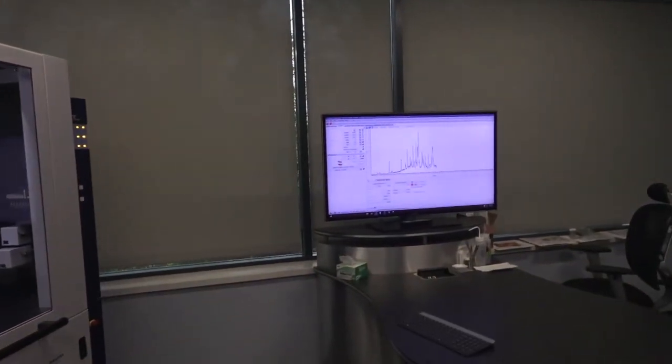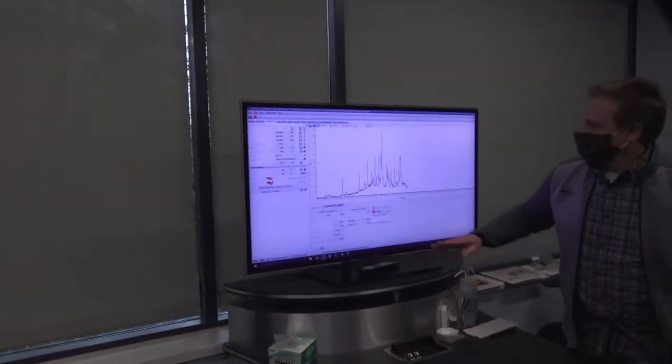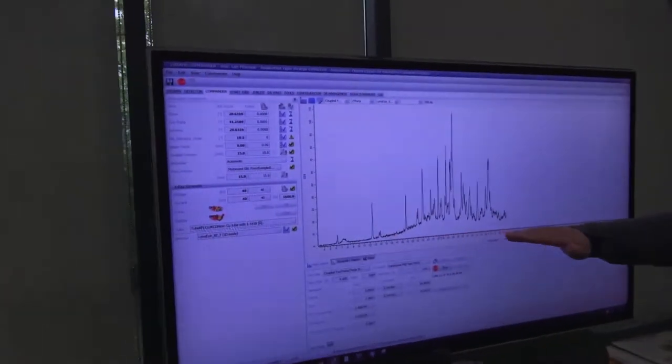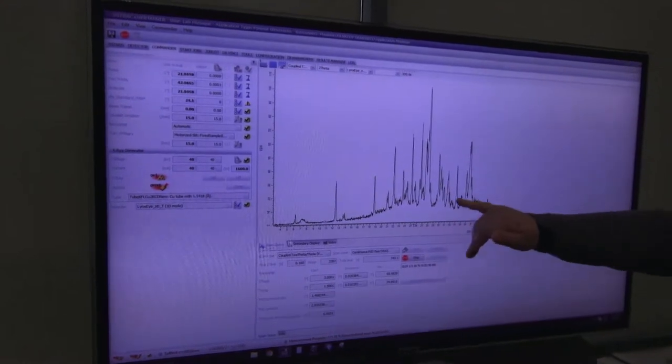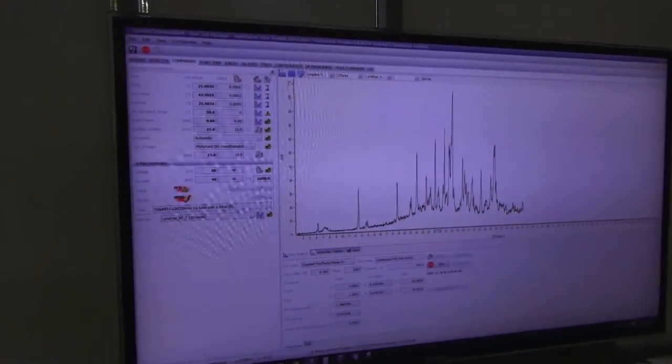Okay. So now, if we maybe take a look back at some of this data that we've been collecting. So look, one thing I'm noticing that's quite different than the classic data would be, I would expect that I would see kind of the intensity staying higher and then the background getting lower. And I know this is probably some sort of an effect of some signal from the sample, but that overall increase of background, what's that coming from?